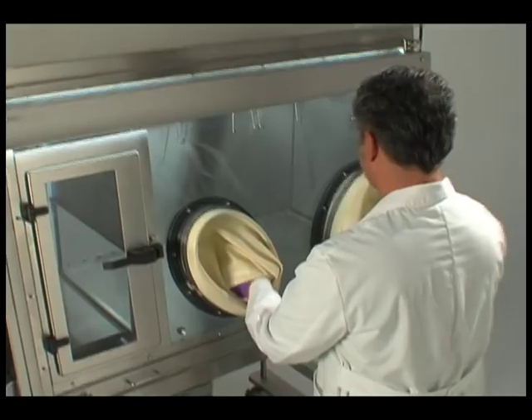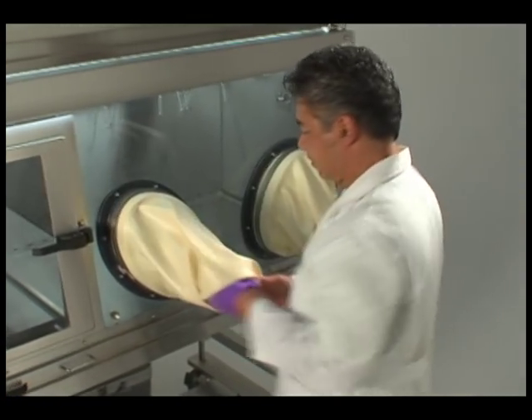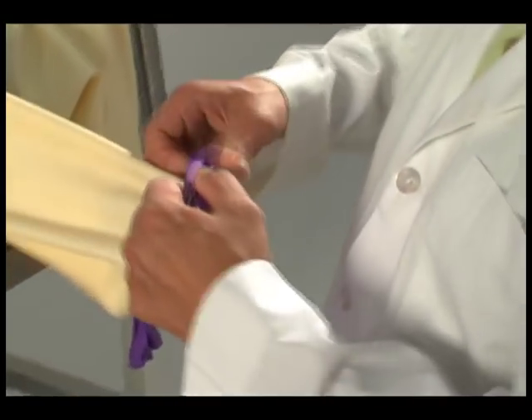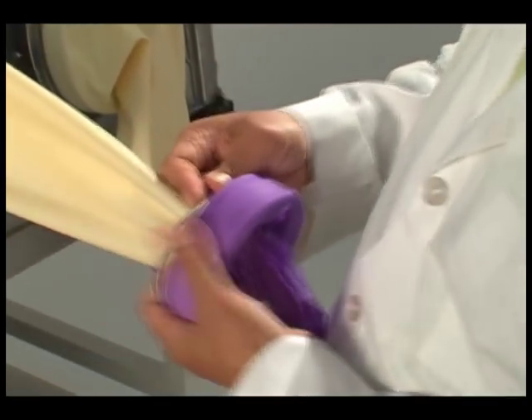Invert the sleeve and glove assembly by pulling the glove back through the glove port and out of the isolator. Remove the stainless steel garter spring from the first groove of the glove sleeve ring.